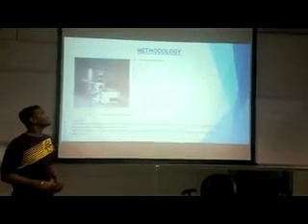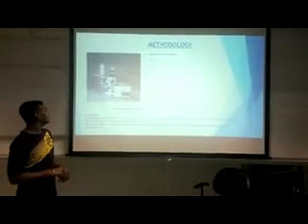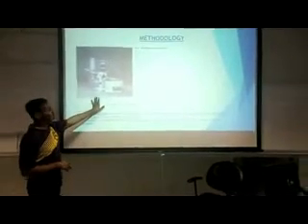Hi guys, I'm DEVENDRAA here. I'm going to do the methodology part. First of all, this is an overview of the rotary evaporator.